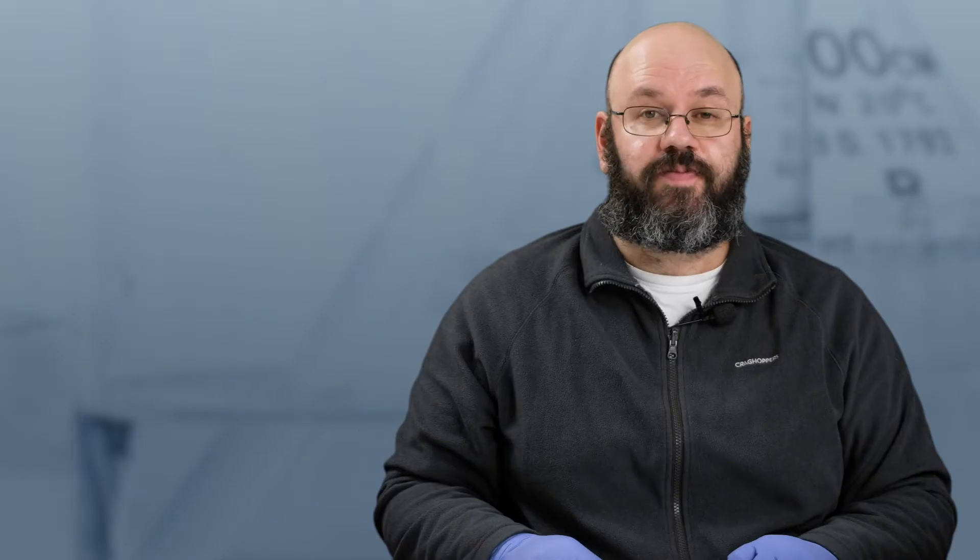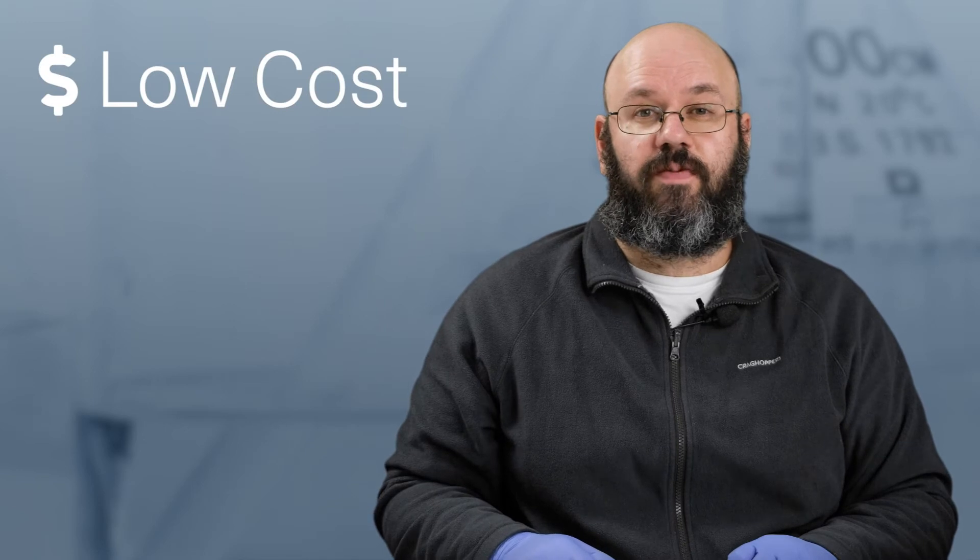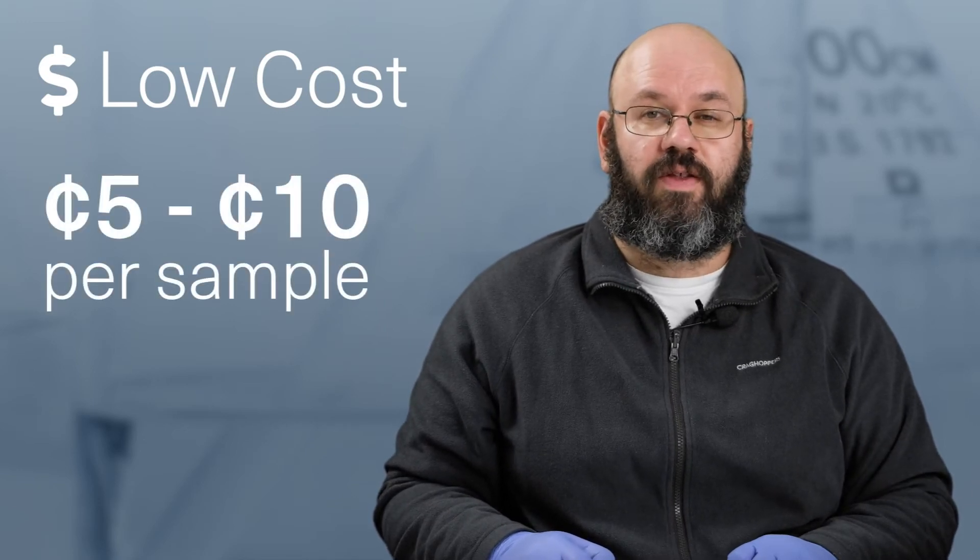So, what makes Hotshot such a useful method? It's very cheap. The cost per reaction is between 5 and 10 cents per sample, depending on the sample size. This makes it ideal for low-cost approaches.